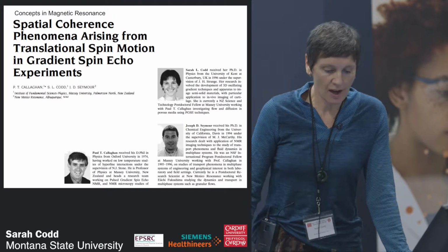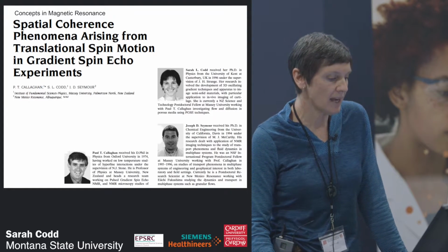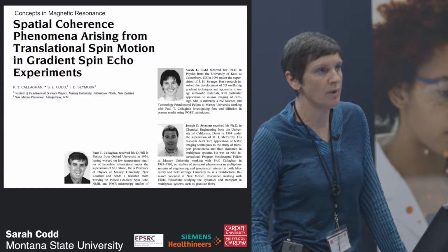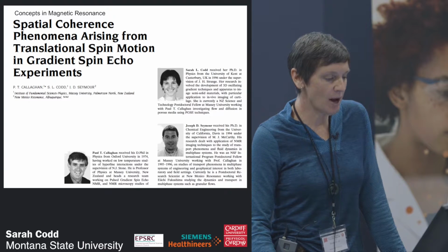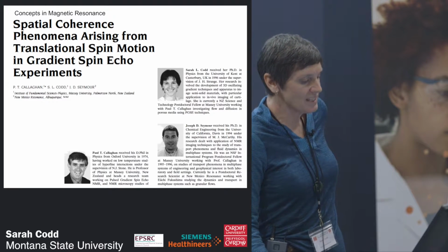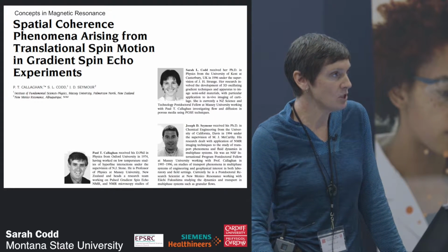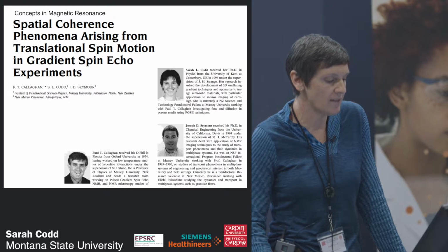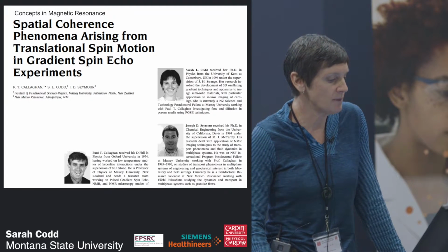So about that time, Joe Seymour came over. He'd been doing a postdoc earlier with Paul Callaghan and had done some of the work that you might have seen from Paul Callaghan that was done in Antarctica. I was working on a number of projects with Paul Callaghan, but Joe Seymour waltzed into the lab and announced that we should measure Taylor dispersion, a phenomenon that was well known in the engineering world that Joe was working in, using PGSE.